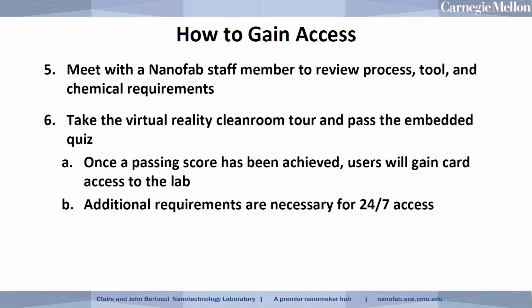Finally, one of the last things that you'll do prior to being able to enter the clean room to start your research is to take the virtual reality clean room tour and pass the embedded quiz. So this is something new that we've implemented, and you'll have to be on campus to actually take part in the virtual reality tour. But we'll talk a little bit more about this later, but I'll summarize it by saying that there's an integrated quiz with the VR video, and after you've passed that quiz and completed the videos, you will then gain card access to the lab.